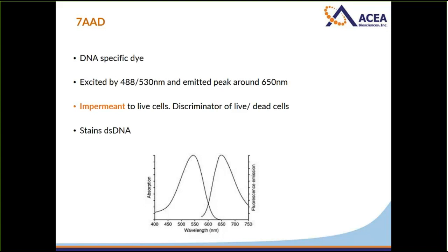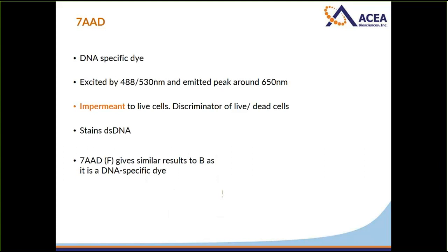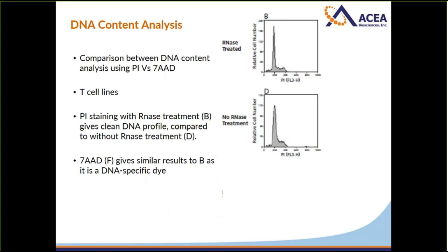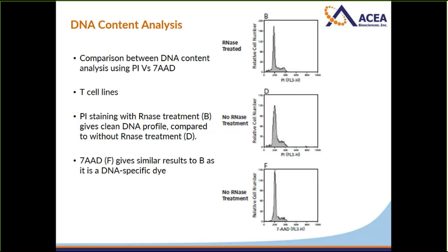What are the differences between PI and 7AAD in practice? Using a T-cell line, cells that were fixed, permeabilized, RNase-treated, and then stained with PI show a very clean DNA profile. In contrast, T-cells that were not treated with RNase show many more events, because PI stains both RNA and DNA — meaning without RNase treatment you overestimate events in all phases. Cells treated with 7AAD alone give a histogram similar to the RNase-treated PI sample, since 7AAD is DNA-specific and requires no RNA treatment.